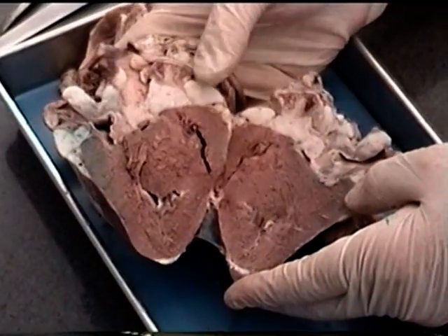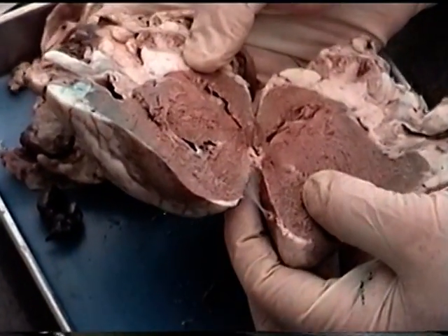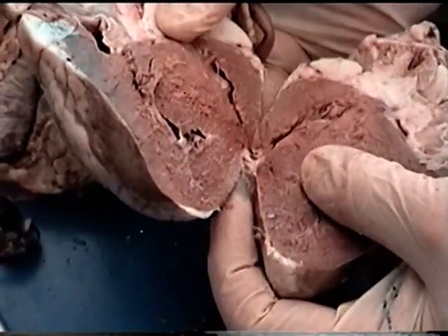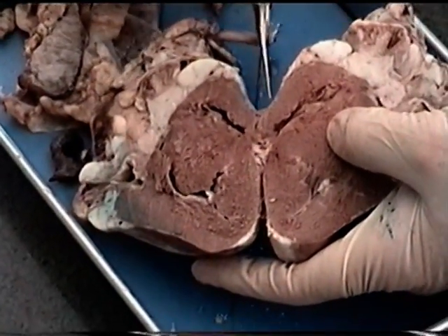So what we've done is we've now cut the heart, and before I continue, notice that there's this real fine tissue that we're seeing down here still keeping the heart together. That would be the surface material covering the heart, which is the epicardium that we can still see. I'm going to go ahead and cut through that so I can separate this into sides so that we can look at them.